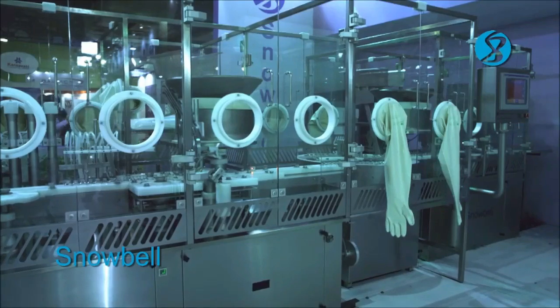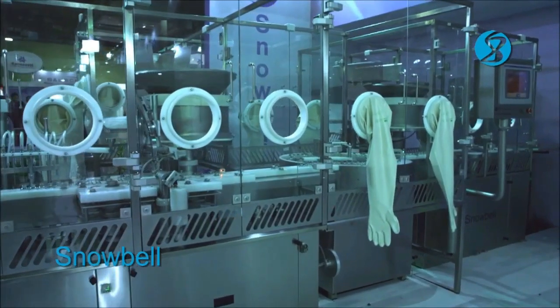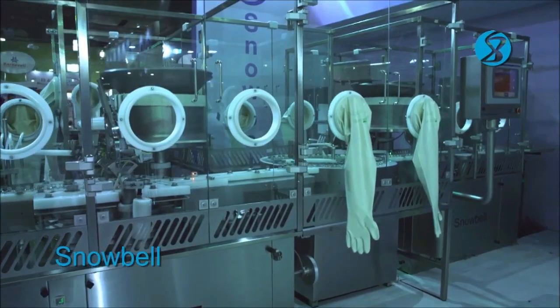A vacuum star wheel picks up vials for rejection and sampling and carries the vials out onto a tray.